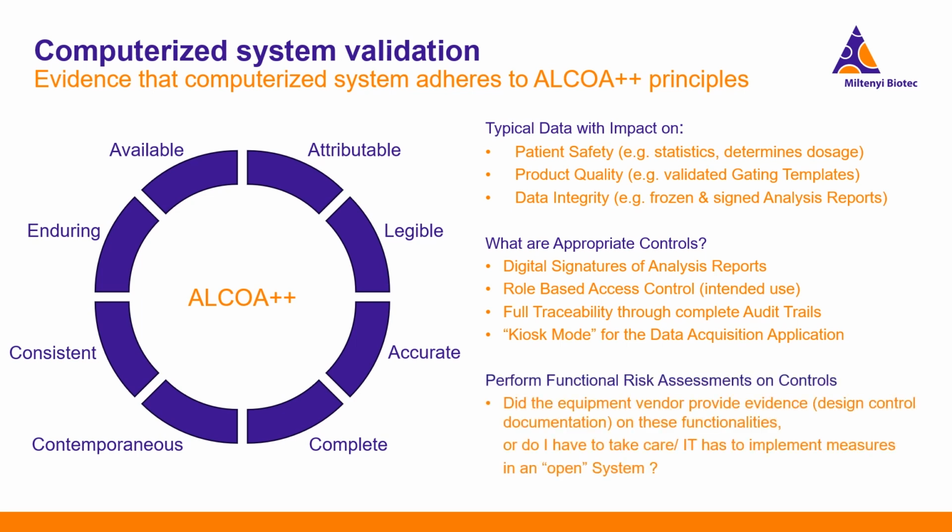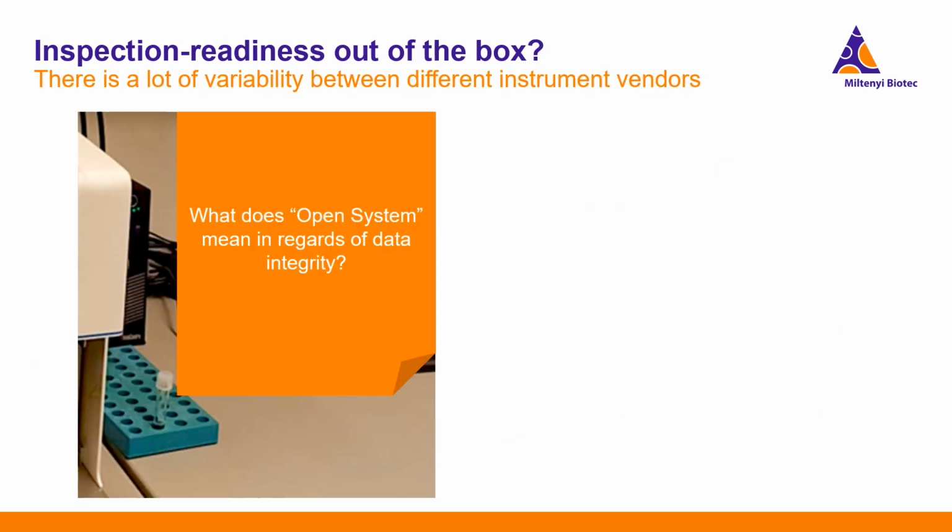Therefore, one of the main tasks of computer system validation engineers is to probe whether all these conditions are given prior to the use of a flow cytometer as a quality control instrument, or whether there is a need to introduce custom technical solutions. Inspection readiness of an IPC-QC instrument like a flow cytometer upon purchase and installation is not self-evident.